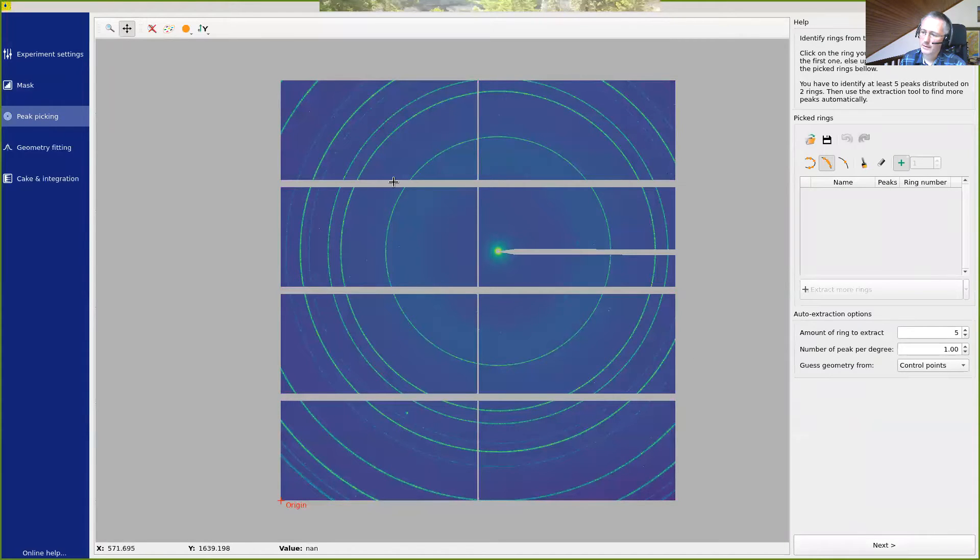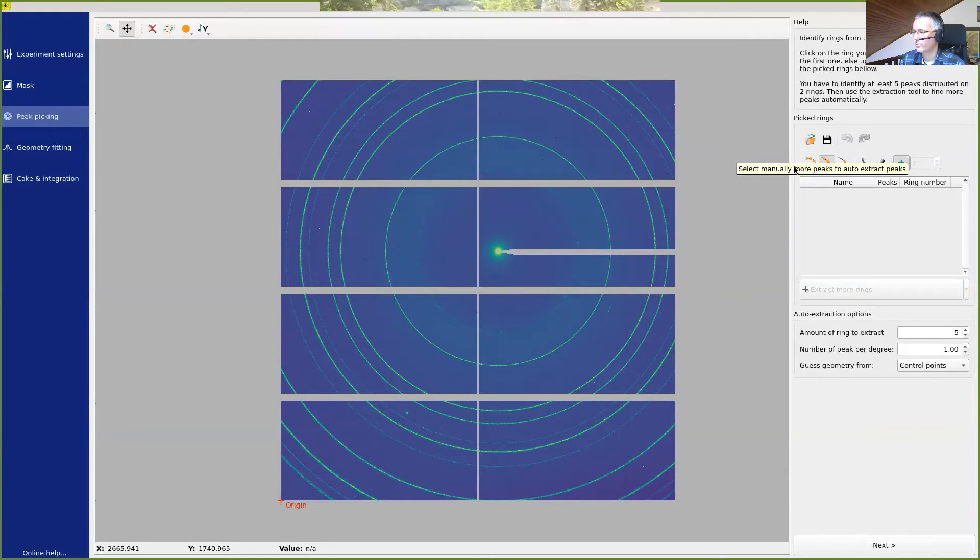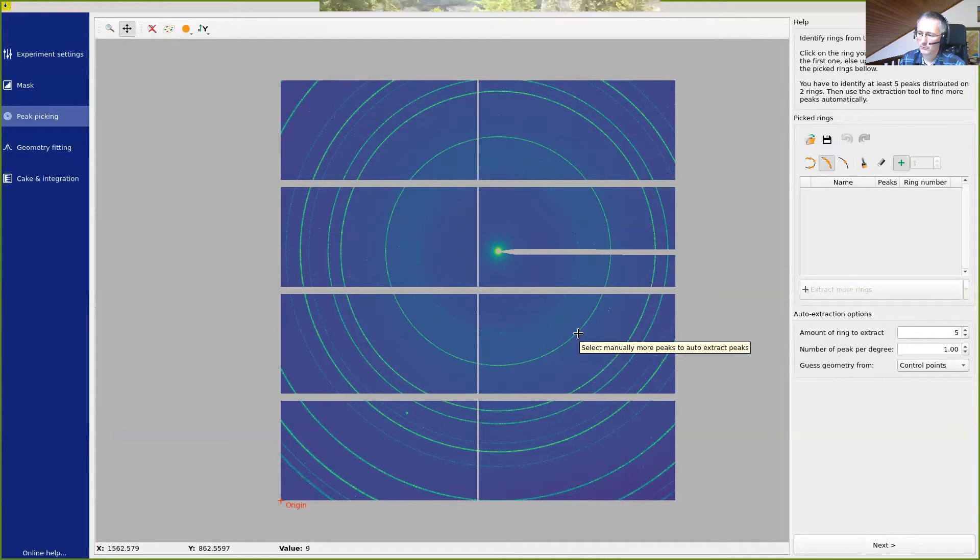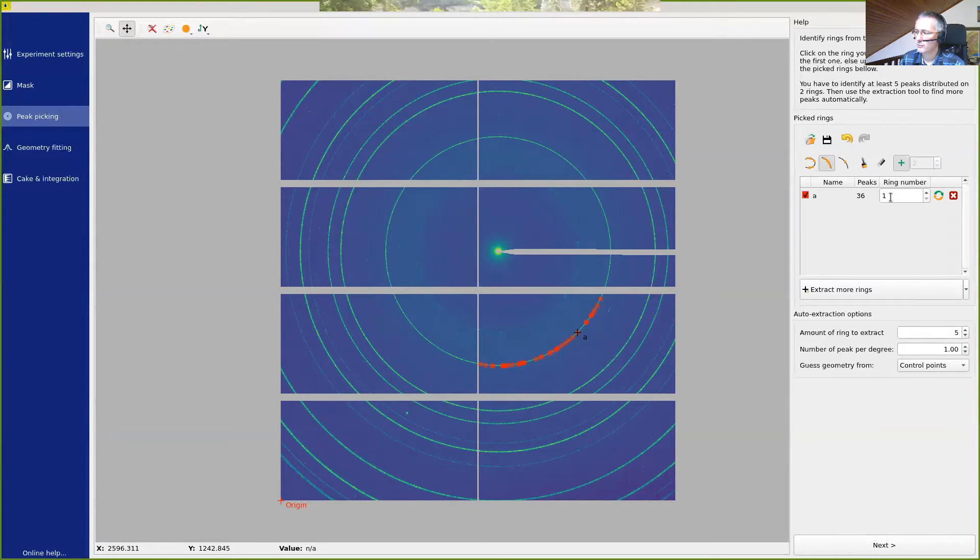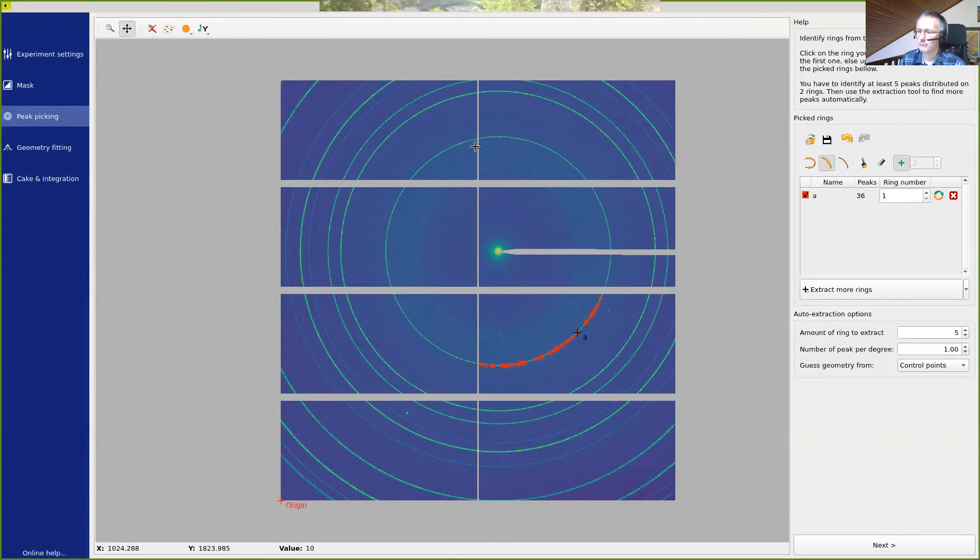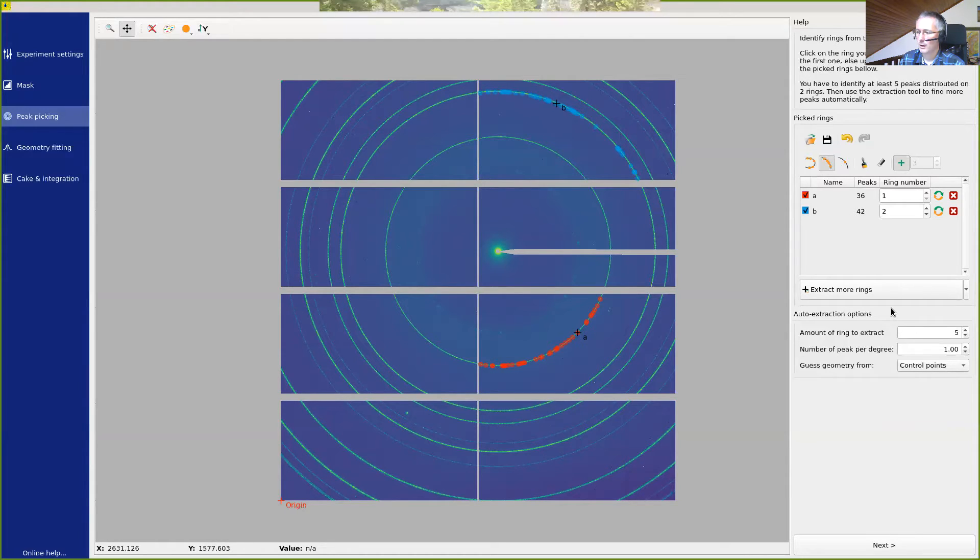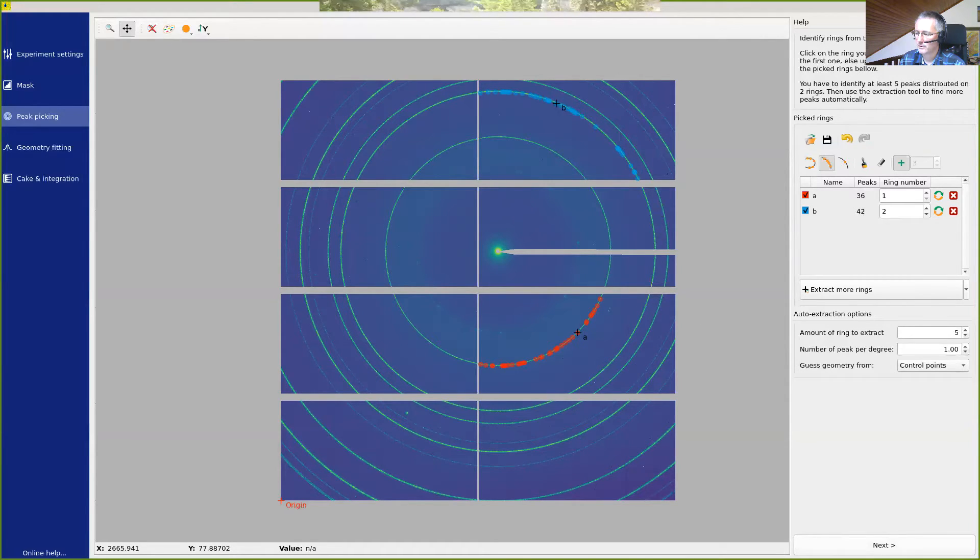The next task is to assign each ring that we see here to a ring number. We have multiple tools available to pick one peak or continuous region of peaks. The idea is just to select the first ring, the first visible ring, and to click on it. This extracts a certain number of points on this ring, which is automatically labeled as ring number one. So this is why we started with the innermost ring. Now we go on the second ring and we pick another set of points, which is ring number two. With those two clicks, we have enough information. We have 36 points in the first ring, 42 in the second. Basically, this will have enough information to determine the geometry.